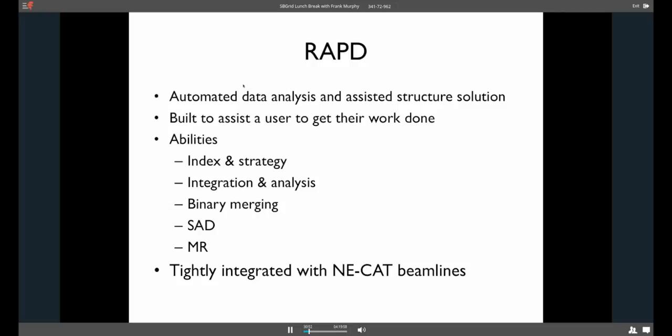So right now the beamline RAPD's got the ability to calculate index and strategies, integration and analysis on the fly. So all that takes place as the data is collected. So you should hopefully have a strategy within about 30 seconds of collecting your test frames and you can apply that to your data run collection. And then the integration should be on the fly. And you should get a good idea before your run's even done how the beginning of your data looks. Right now, one of our beamlines has the new Eiger detector and we're not quite set up for that. So that's not exactly the case on the E beamline right now, but it will be soon again.